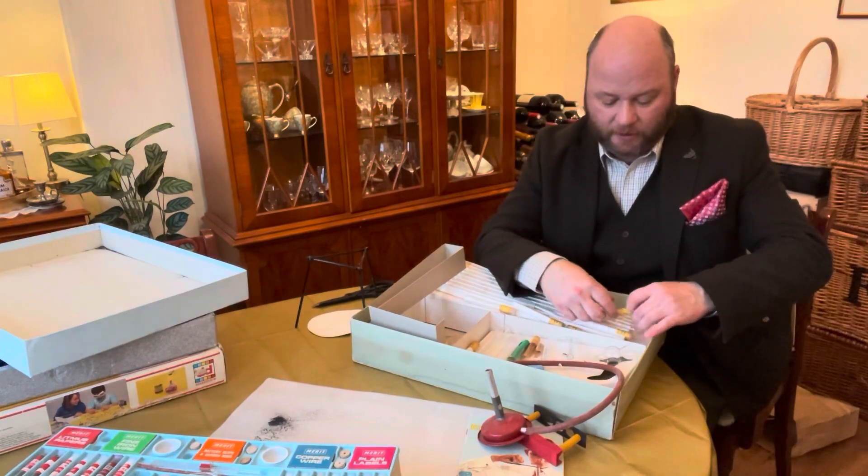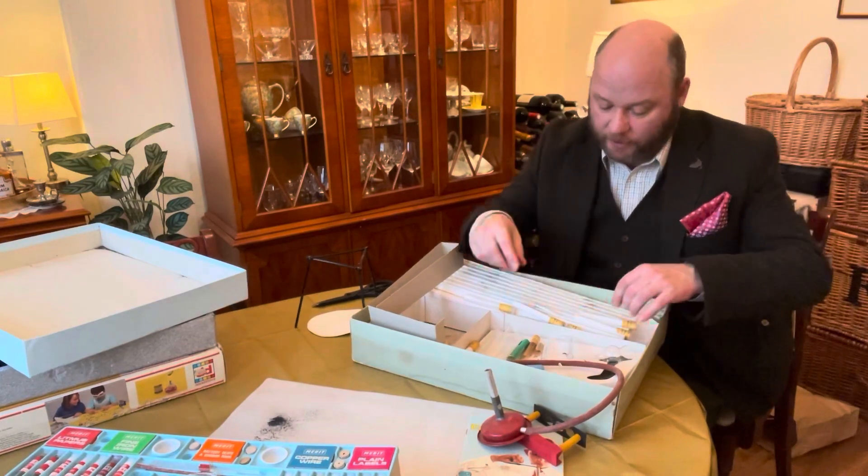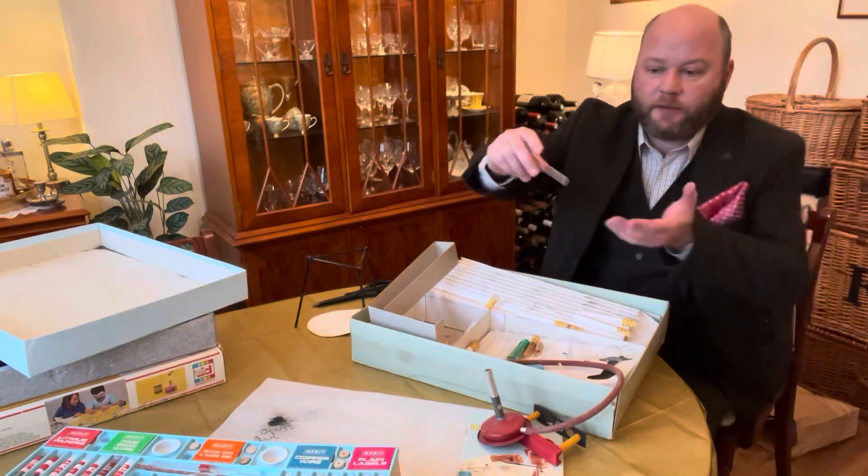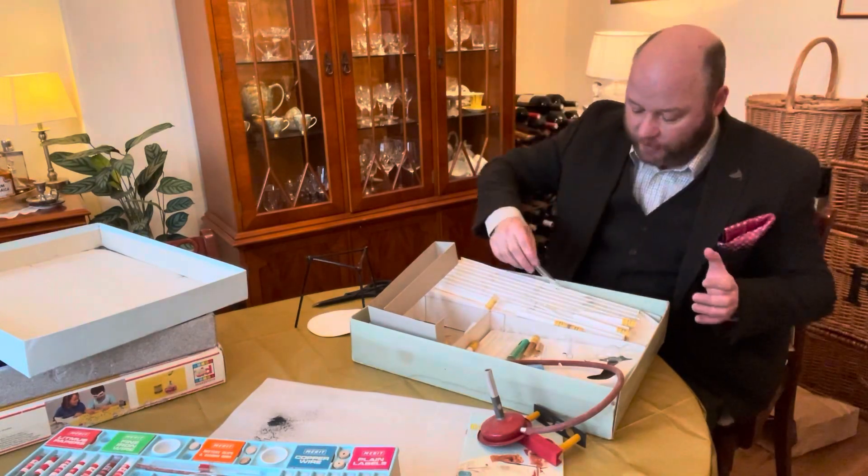There's magnesium carbonate and sodium carbonate. So we'll have to clean all this up. That's what the black substance is in all of these little test tubes — they're filled with potassium permanganate.